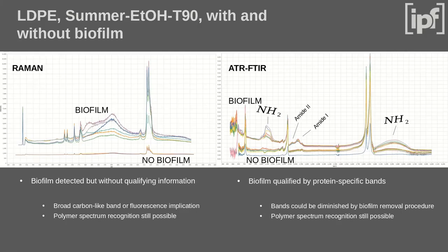So here we see, for example, a comparison of LDPE, as it says in the slide title, from the summer campaign after exposure of 90 days with and without biofilm. So as I said before, the biofilm that has grown on there has an effect on the spectra that we obtain with these surface-active spectroscopy methods, of course.